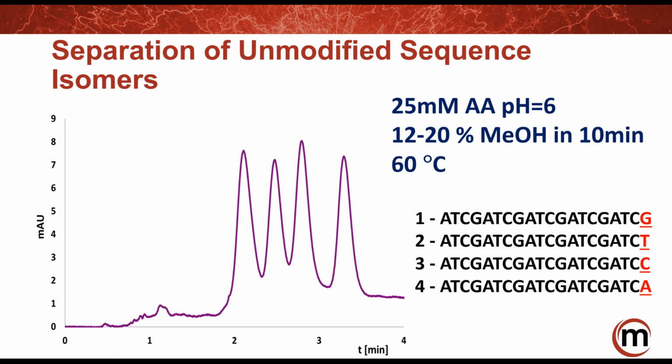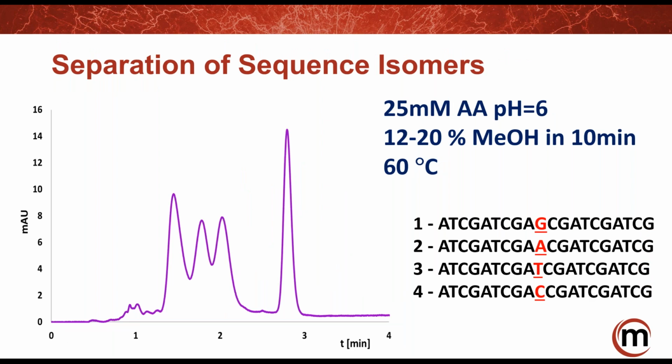And also, what you see earlier around 1 to 2 minutes are the impurities in the process that were captured, and to know what those are, and the fact that they've been pulled away from the actual main peaks of interest is exciting as well, because that would be something that you could scale right to prep, and you have enough room there to just isolate what you want and shoot the other stuff out the back. Another thing here where the process impurities are pulled away is one nucleotide change in the sequence. Again, pretty exciting. Enough separation.